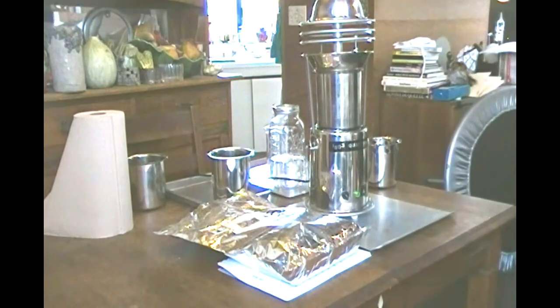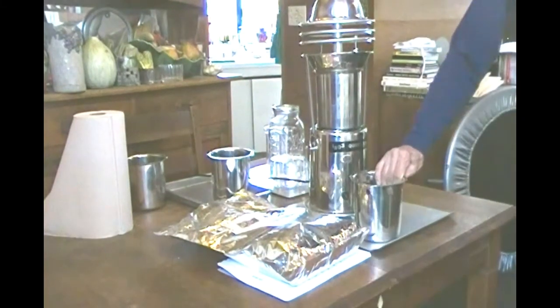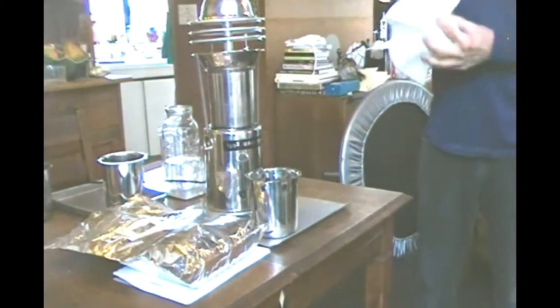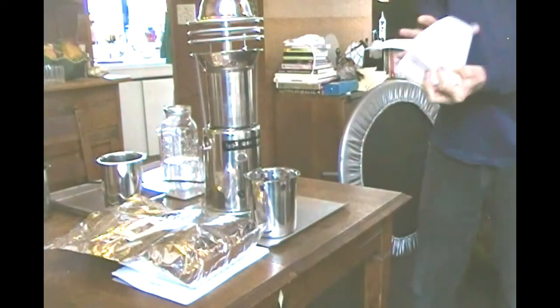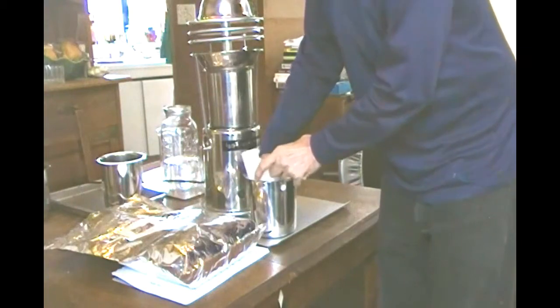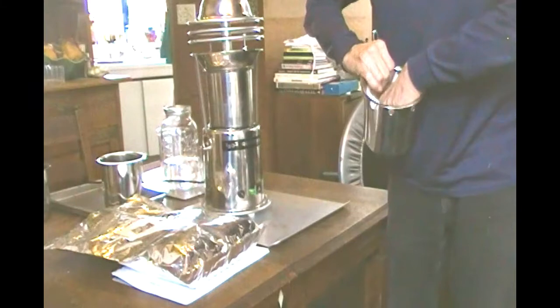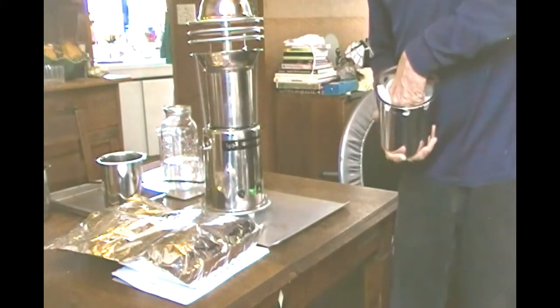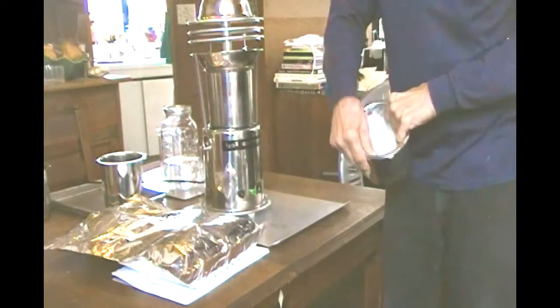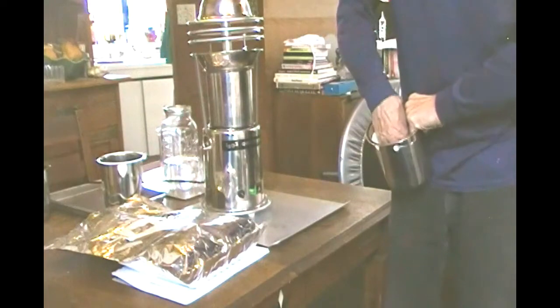So the first thing I'm going to do is fold a filter paper and fit it into the extraction basket. So an easy way to do that is kind of like this. Push it in there. Push the edges down so they go all the way on the bottom, and ascertain that the holes on the top are open.